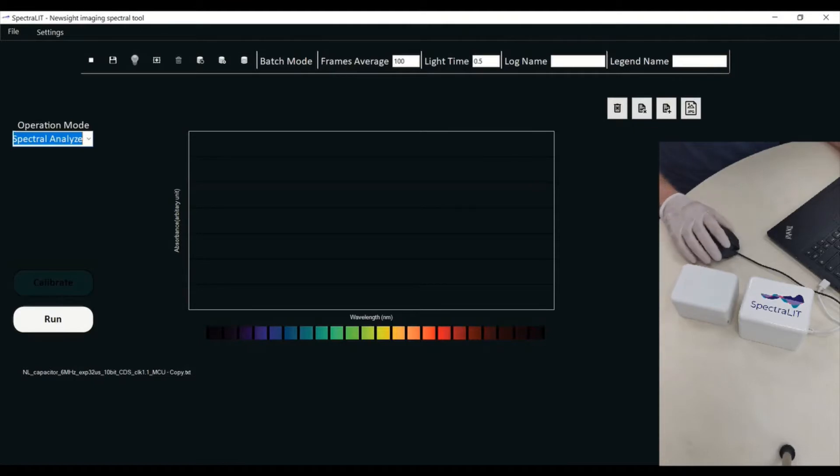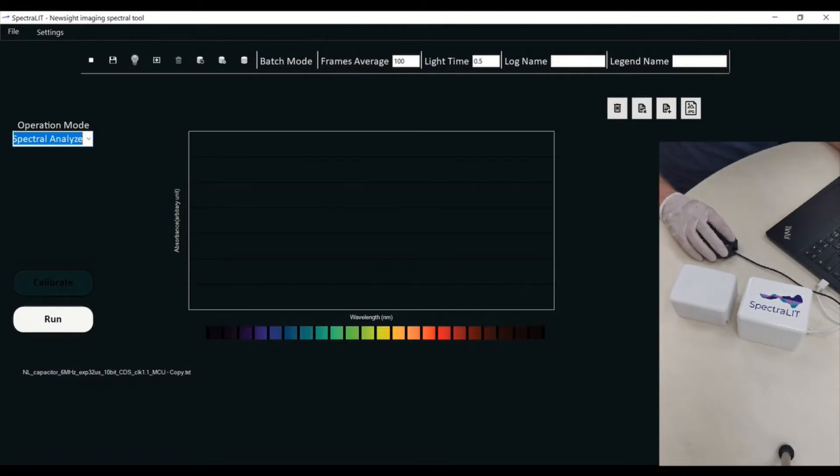Hi everybody, we're going to be showing you a quick demonstration of how the Spectralit is working.